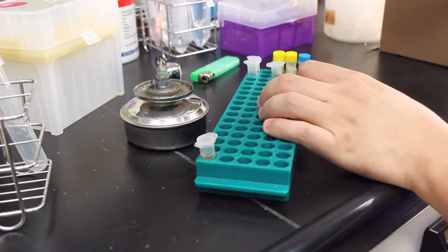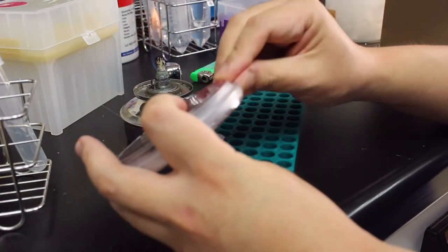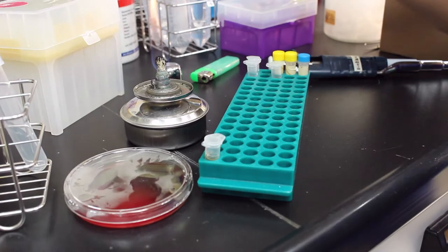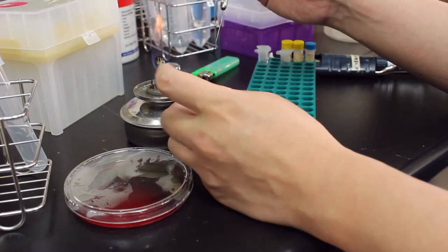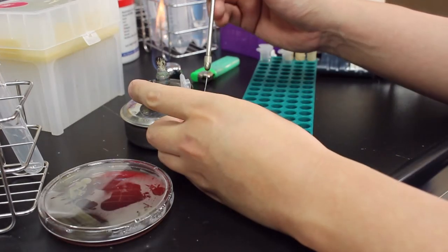Well, not that it has anything to do with me - I still have to go to work anyway. So I tried to film some footage of bacteria growth since I finally been able to mount my time-lapse camera on a microscope.